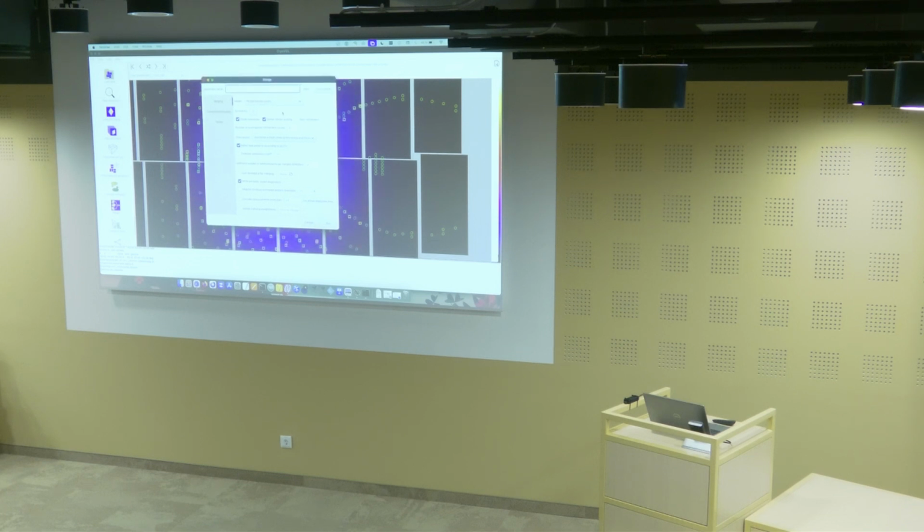So we have different models to scale and merge reflections. The simplest one is process_hkl, where we just average over everything. Then we have Xsphere, which is the full post-refinement. And then we have something in between, which is the Unity model, in which we will not try to assign partialities, but still we can do some more scaling. I'll just take the simple merging because that will be the fastest one. So I do merge, and this is going to be the Monte Carlo method. We have to select our symmetry, so this is, again, the orthorhombic symmetry.